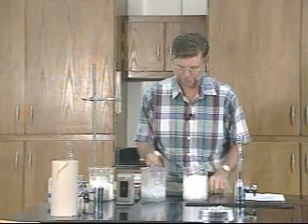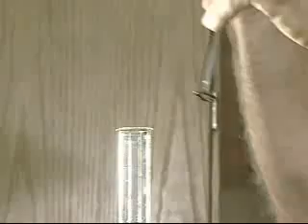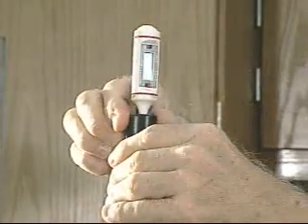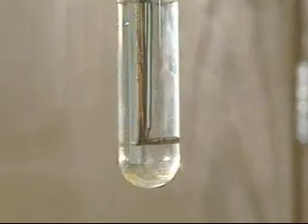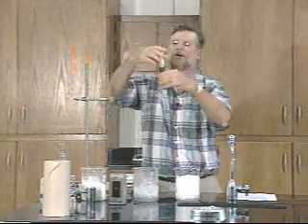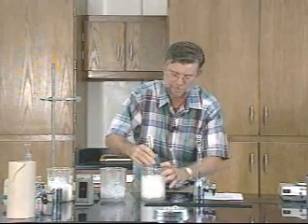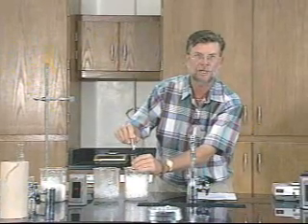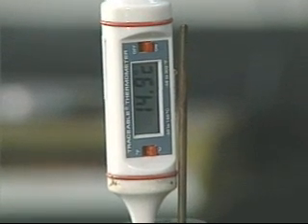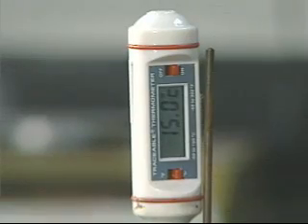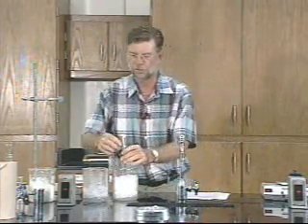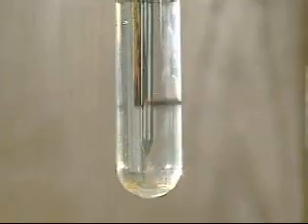Now let's assemble the apparatus — carefully put it back together, being careful not to damage anything. Take the apparatus with the thermometer and stirring bar and carefully immerse it down into the cooling bath. Observing the thermometer carefully, begin recording temperatures every few seconds. You can record them on the back of your experimental sheet. Record temperatures until the temperature becomes relatively constant — you want about three or four constant readings. You may notice ice forming in the apparatus; just stir it up and down with the stirring rod.